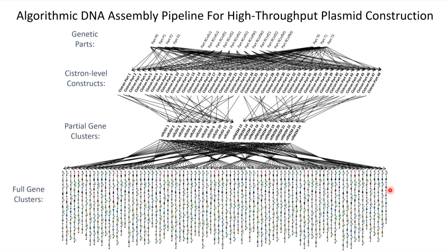is that we predefine the molecular biology of DNA assembly before going through any of this work, so that the same restriction enzymes are used to build all of our cistron level parts, and we're going into the same plasmid backbone. And that standardization of the reaction protocols to build any of these diverse DNA sequences in the end is what makes it fairly trivial for us to build 50 or 100 plasmids in the same day, because the only thing that changes in one plasmid design from another is what tube we went into to get the original genetic parts from.